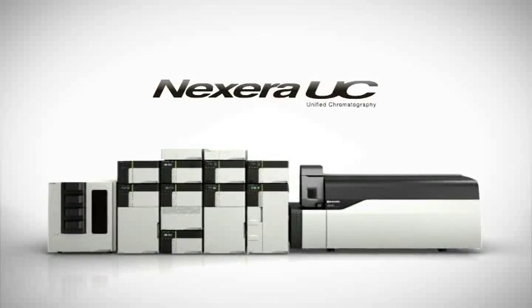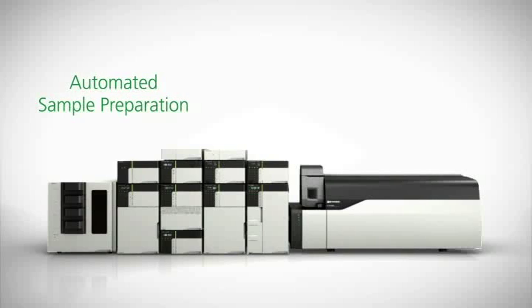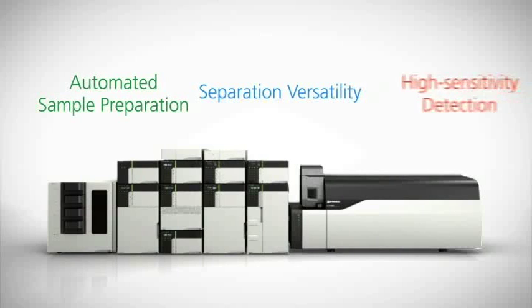Nexera UC brings together leading-edge solutions for online sample preparation, separation mode flexibility, and high sensitivity detection.